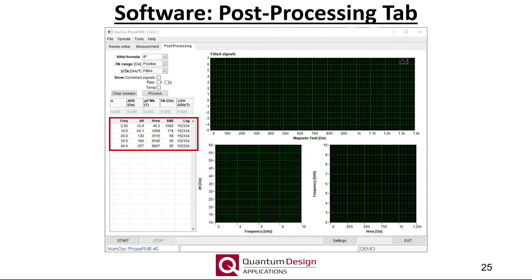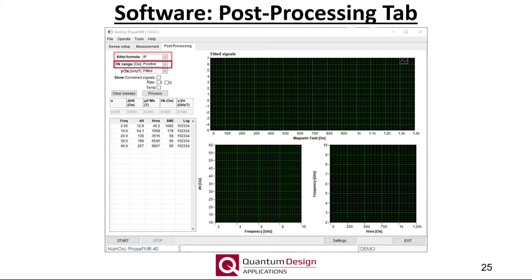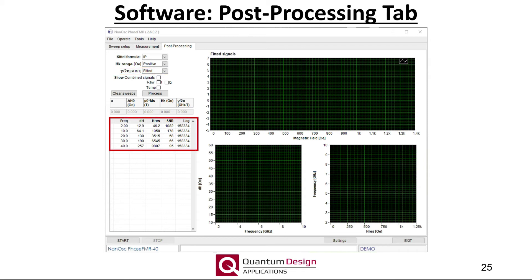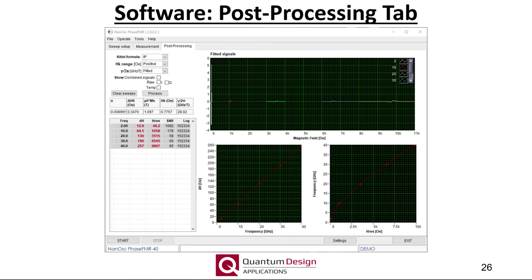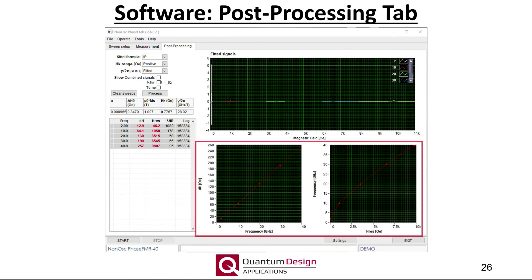While I can review results after the measurement, one can proceed to the post-processing tab, as shown here. These values represent the fitted resonance field and line width for each frequency from the prior measurement. Depending on the coplanar waveguide used, one can choose either an in-plane, as shown here, or out-of-plane geometry. Furthermore, additional constraints upon the anisotropy field and gyromagnetic ratio can be selected here. For example, one can choose to fit these values or fix them to a particular number. The specific spectra used in the Kittel fitting can be cherry-picked, or one can simply choose to select all by using the Ctrl-A keyboard shortcut. Once the spectra have been chosen, simply click the Process button to commence fitting. The resulting Kittel fit and linear fit to determine the Gilbert damping are then shown here. The extracted fit parameters of the effective magnetization, anisotropy field, damping, and gyromagnetic ratio are all then displayed here. The process data can be saved by choosing Save Process Data from the File menu bar.